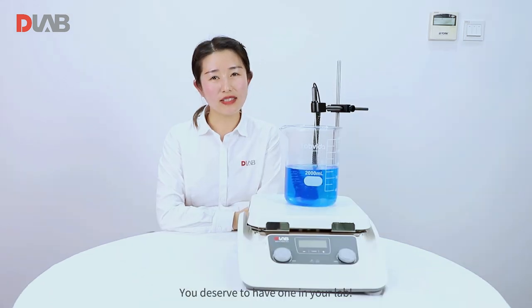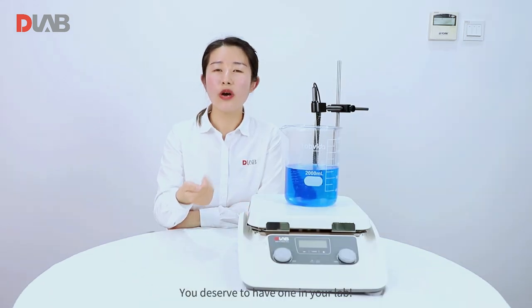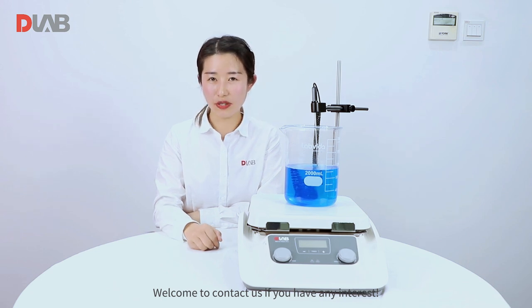That's all. You deserve to have one in your lab. Welcome to contact us if you have any interest.